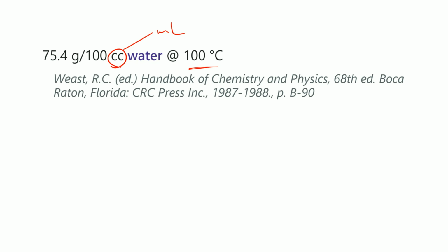There's less than an entire atmosphere pushing down, so the water in Canberra boils at roughly 98.5-ish, maybe 99 degrees Celsius. And also remember that that whole 100 degrees Celsius at sea level is for pure water. This water is not going to be pure. I'm dissolving some copper-2 sulfate in it, so that will also affect the boiling point.